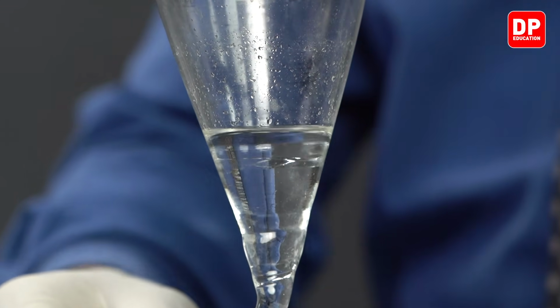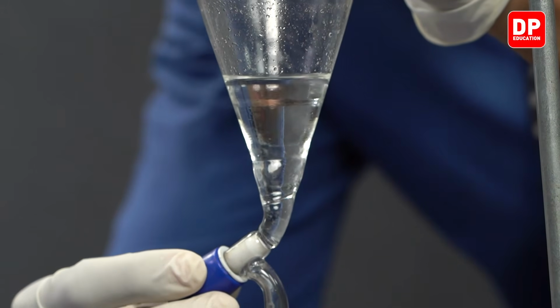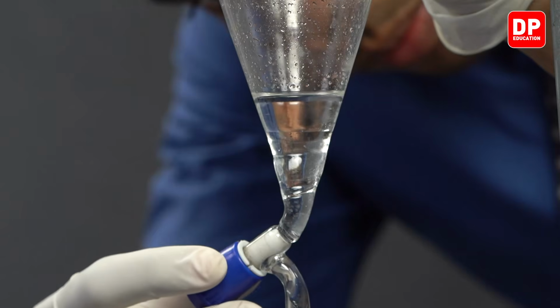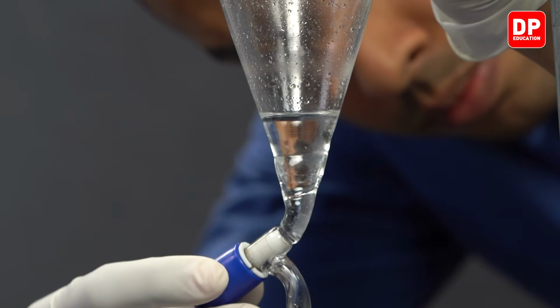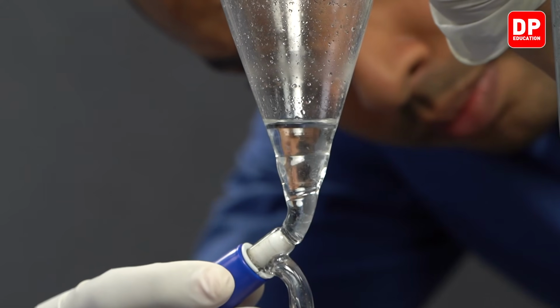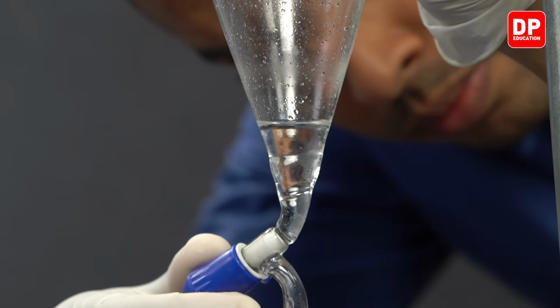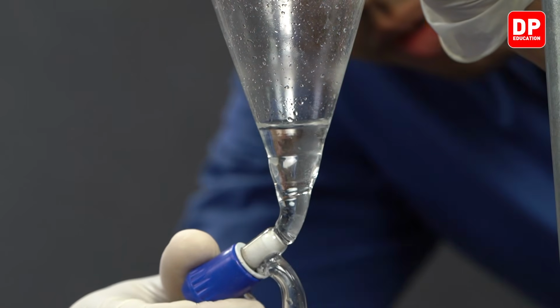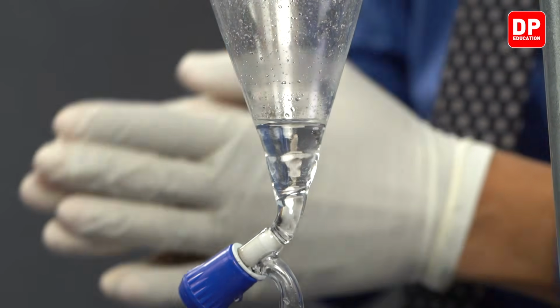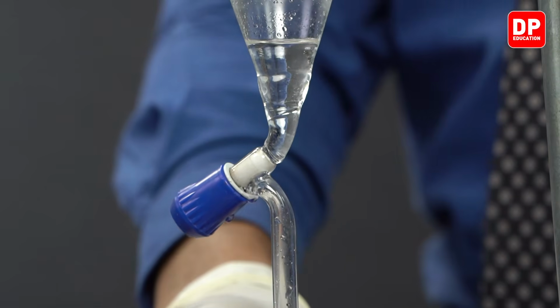So let's proceed to separate them out. Now we have very carefully separated out our aqueous layer.